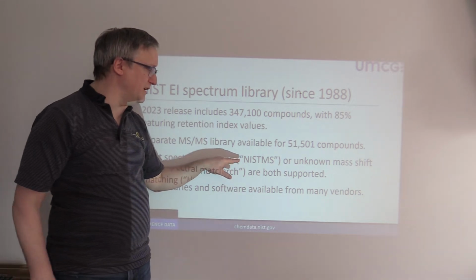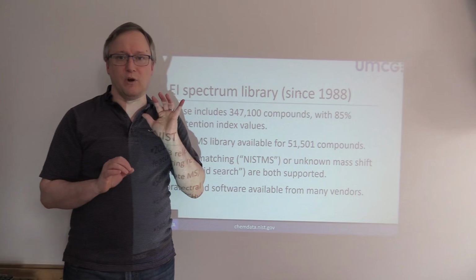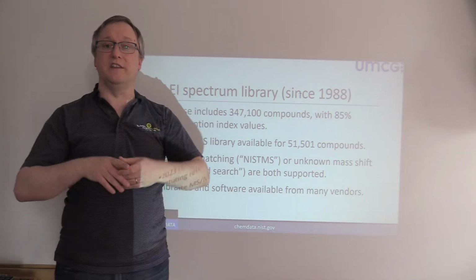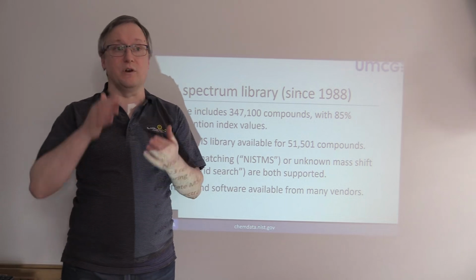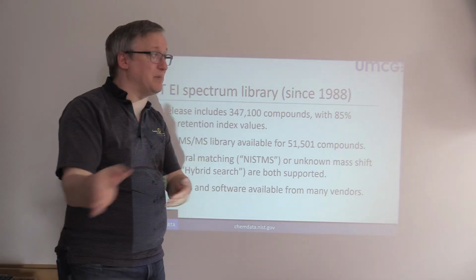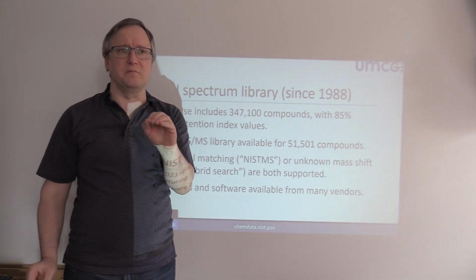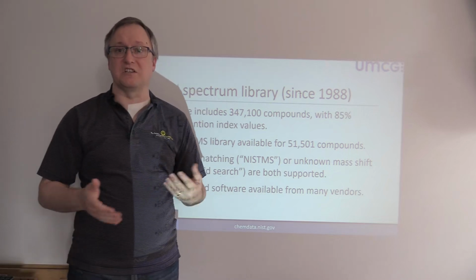So we start with the NIST MS software. The intent here is that we're going to compare spectra that we've collected experimentally against all corresponding members of the spectral library. The NIST MS software does that for us. So this is lovely when what you're capturing is a metabolite that exists as a perfect match in the NIST library. But what happens if the compound you've measured in your mass spec differs by, say, a single methyl versus what appears in the NIST spectral library?